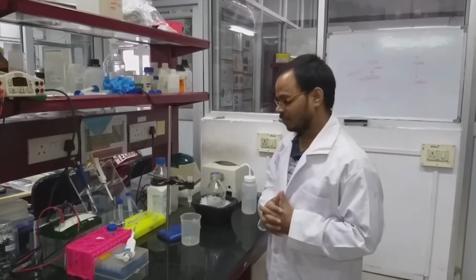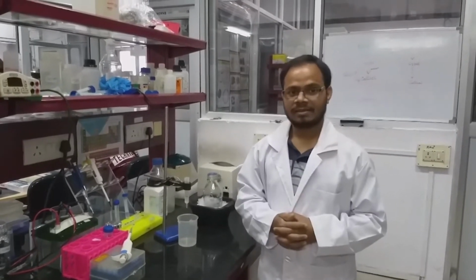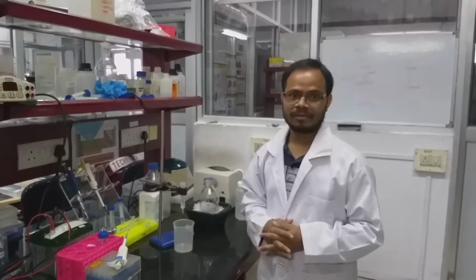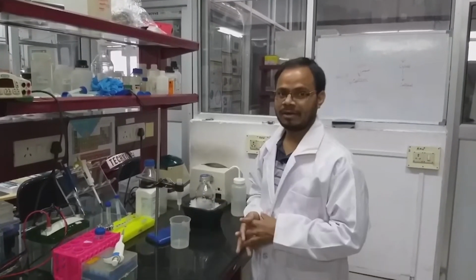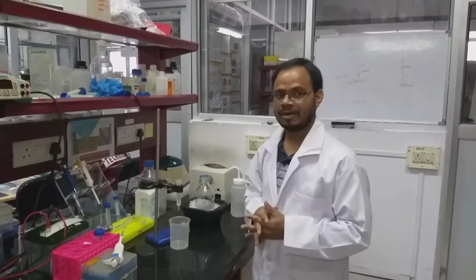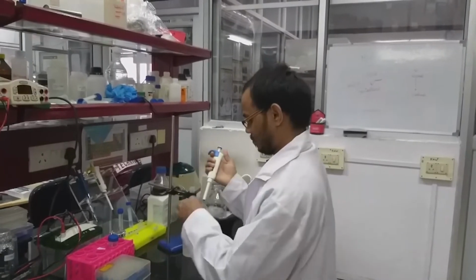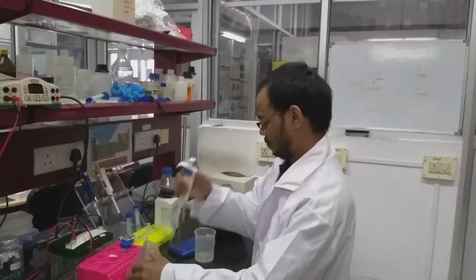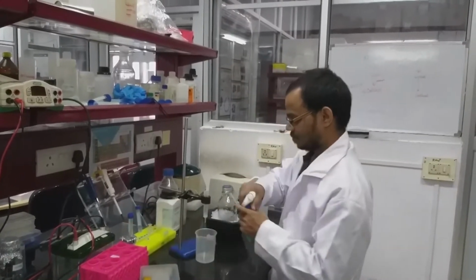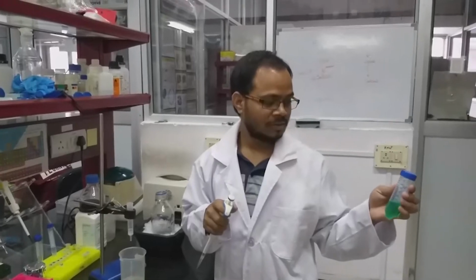So here what we will do is we will charge the beads with the nickel and then we will equilibrate. We already washed the column with water and 0.2 normal NaOH and again with water. So now we will equilibrate. So this is a nickel chloride solution.